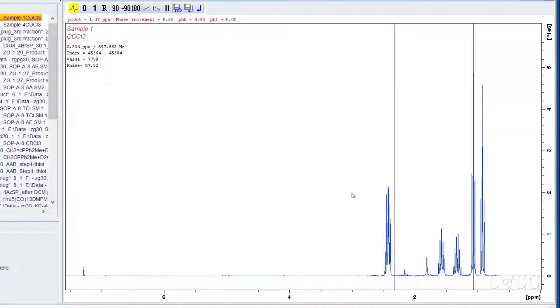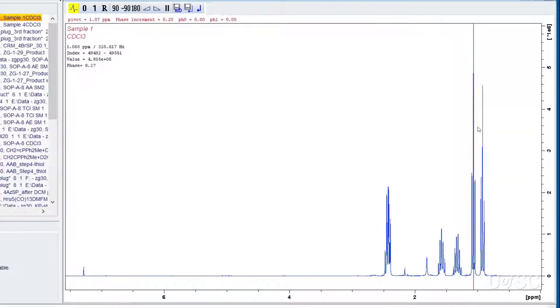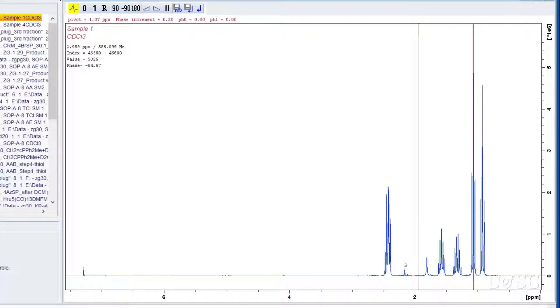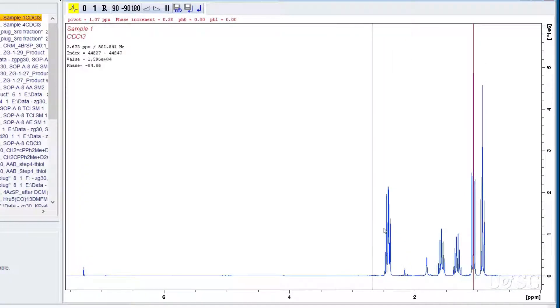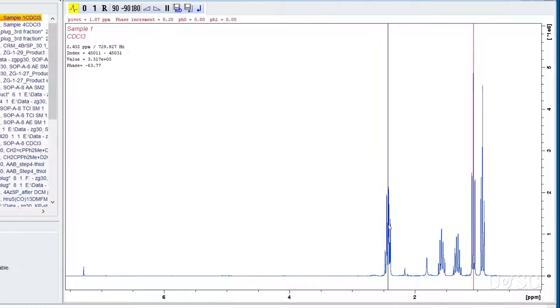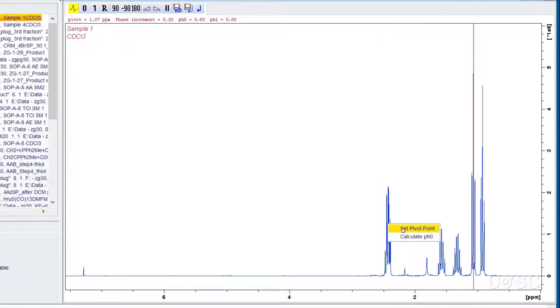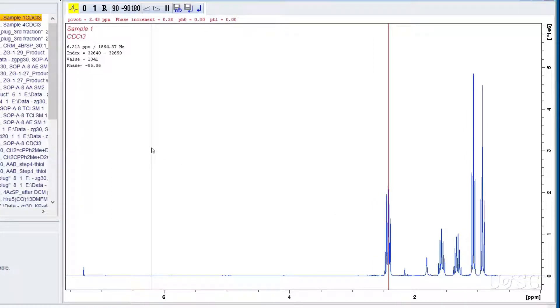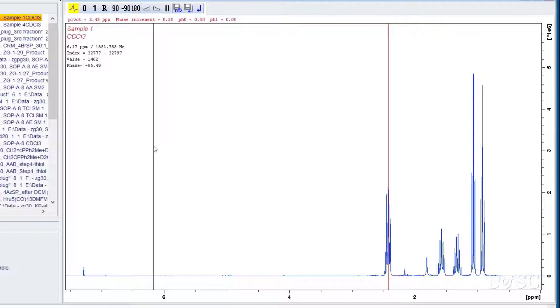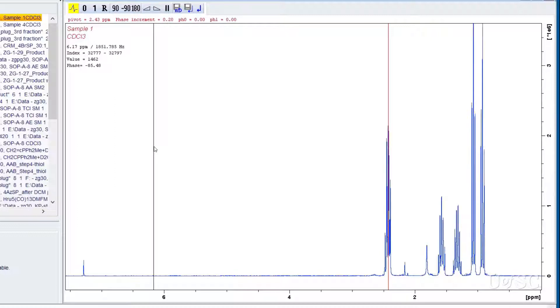Note the red cursor that now appears in the spectrum window. This is the phasing pivot point and topspin places it on the tallest peak in the spectrum. If there is a reason to change the pivot point you can right click at the desired location and choose set pivot point. This is usually not necessary since correct phasing can be accomplished with the pivot point on any peak. You just need to know where it is before you make any adjustments.